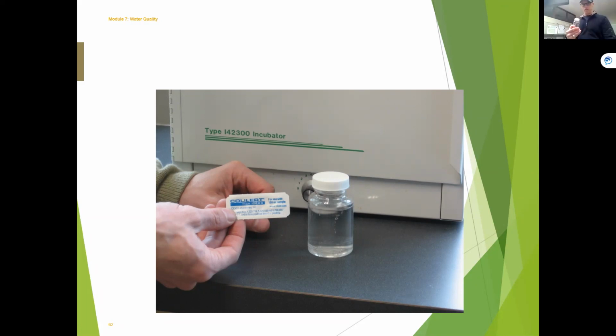I'm being very careful because as I'm doing this, two things here. I never, ever will touch the threads in here. And if you touch any of this like I'm doing right here, the sample's no good. You got to throw it away. The other thing I'm doing is keeping the lid down. If I do the lid like that, airborne bacteria can get in here. So I keep the lid down just like that. I'm going to fill this to the 100 ml mark, and there is a 100 ml mark there.